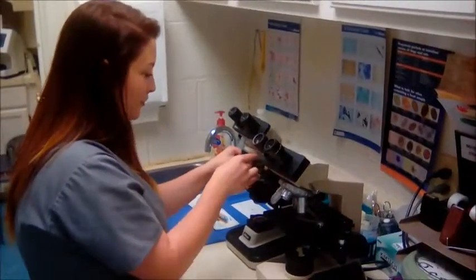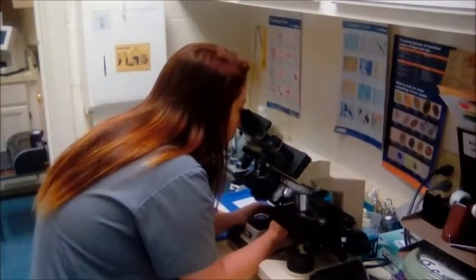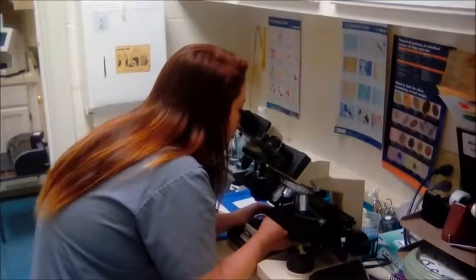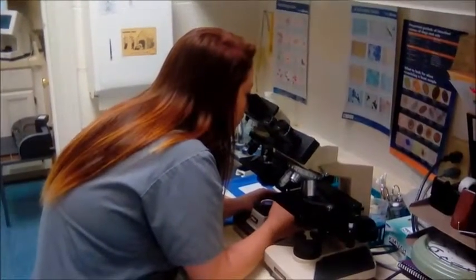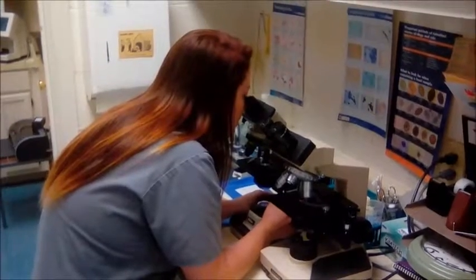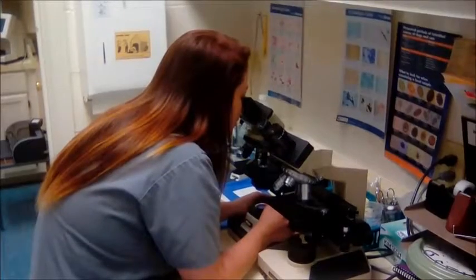And I'm going to move it up to 40x. And I'm going to count how many yeast bodies are in each field and I'm going to count 10 fields. And then I'm going to adjust the microscope.